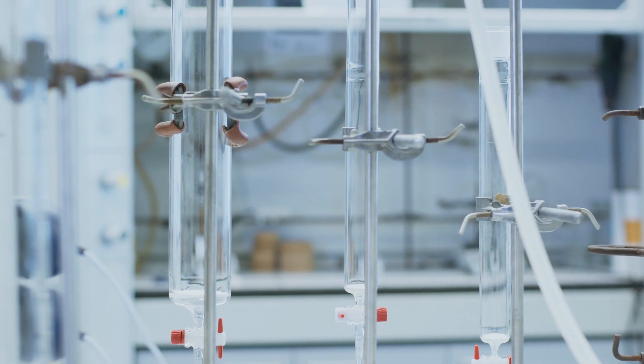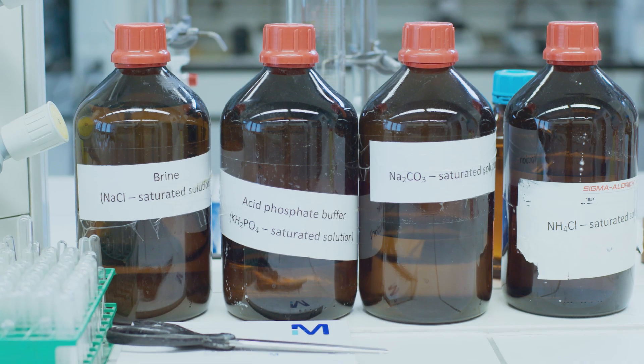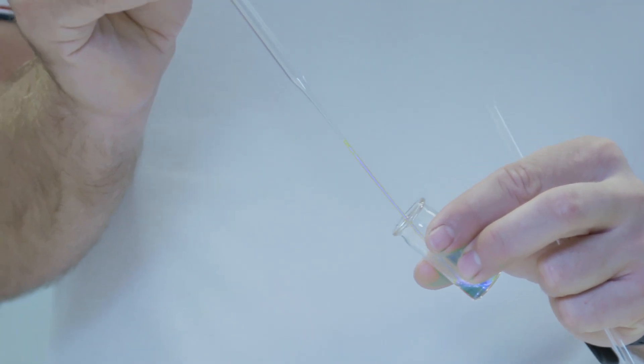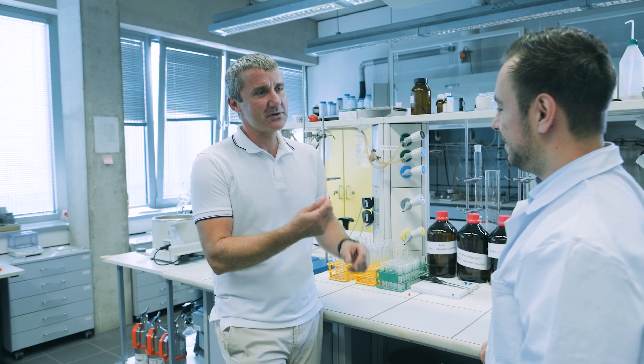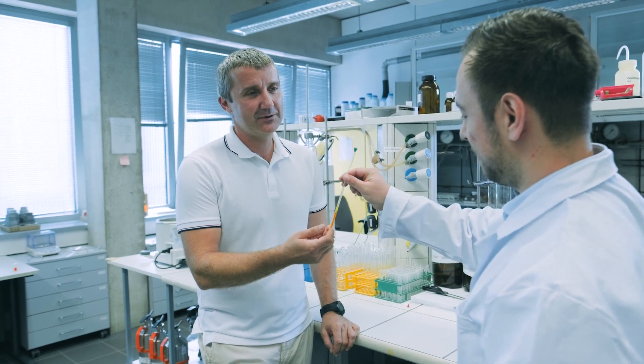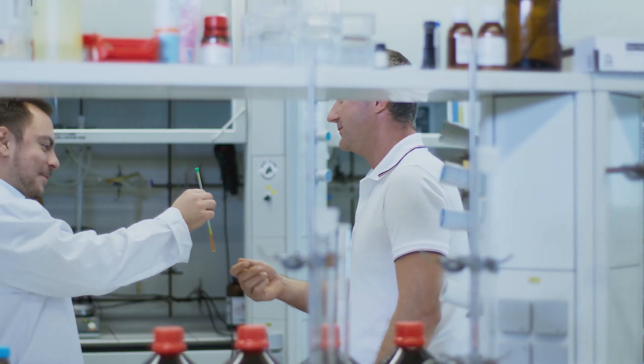And it helps a lot because it frees up time for more sophisticated NMR experiments in the NMR lab, which we have available at the Faculty.